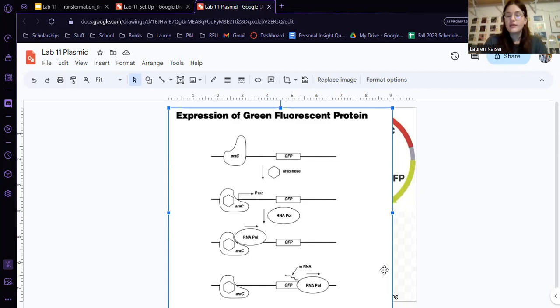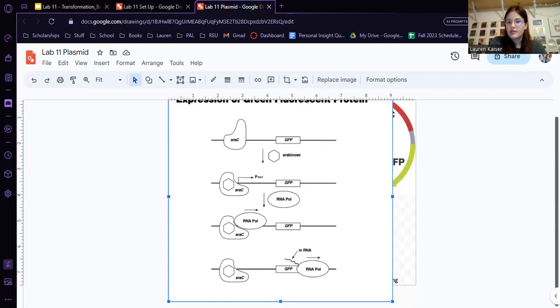Because before, they didn't have several copies of this gene, because that gene hadn't been turned on until now. Only in the presence of it will that gene turn on and be actively made. So that should be good there.